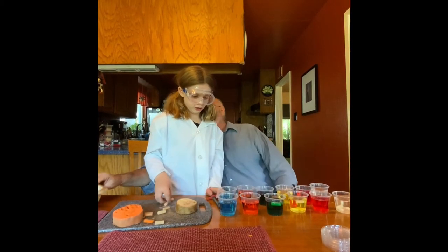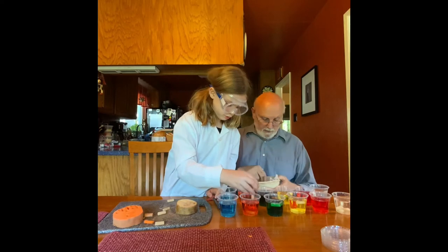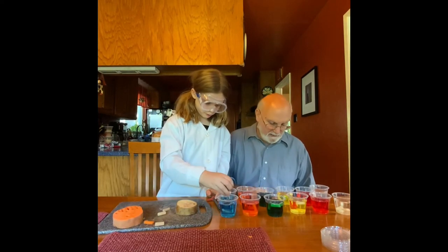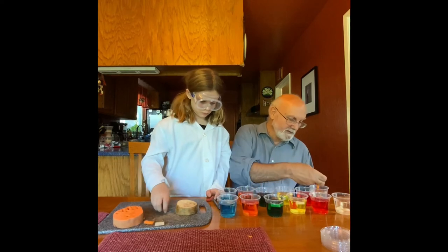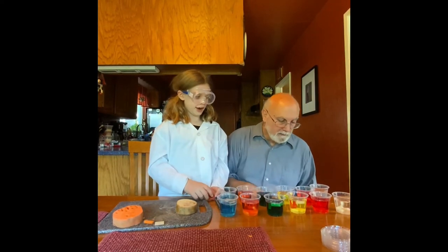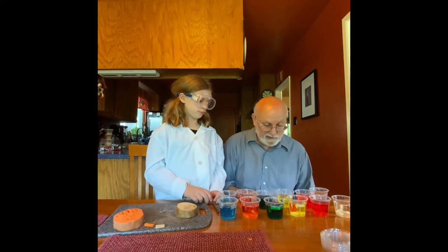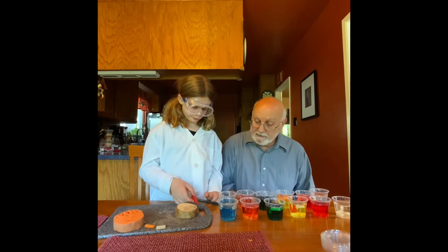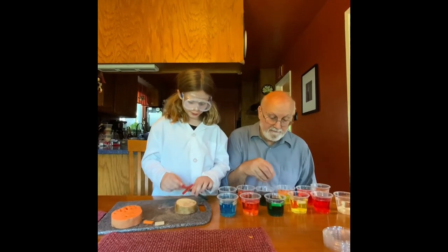Are they going to change color? That's a good question — they don't really change too much color; there's not enough food coloring in there to make them actually change much. It's basically just sugar water with dye. There is a little bit of bleach too, so we don't get any bacteria or fungus growing.